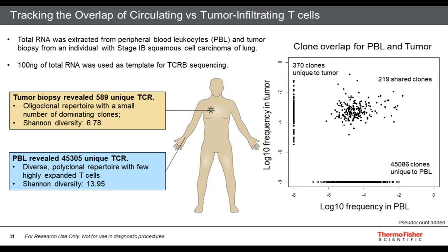So we use this to study the question of whether you can profile the T-cell repertoire in the tumor microenvironment and study it in the context of other co-infiltrates that may influence T-cell function in the tumor. To that end, in this study, we interrogated the tumor microenvironment of 19 non-small cell lung cancer samples. We started with fresh frozen tissue biopsies, and we ran them on the TCR beta long read assay and on the immune response expression assay.